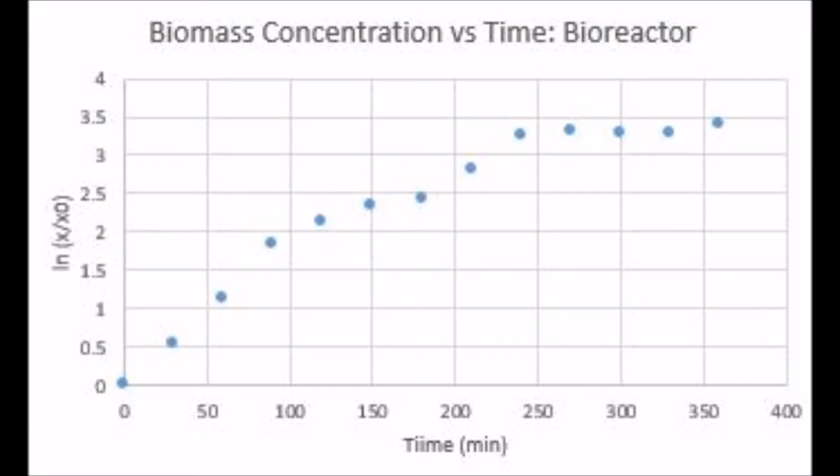Looking at our data, there is no initial lag phase and it appears to start initially in the exponential growth period. After 250 minutes, the concentration semi-plateaus and is consistent until the bioreactor had to be shut off. Because the bioreactor had to be stopped preemptively, there is no death phase that can be seen in the plot.